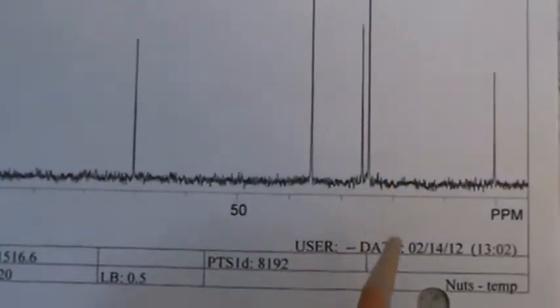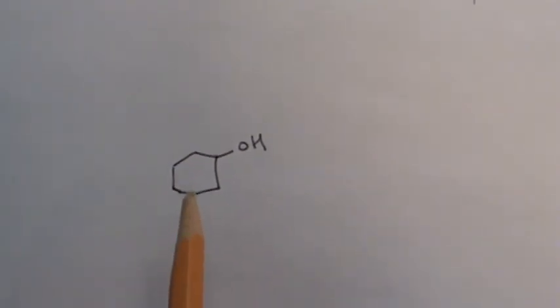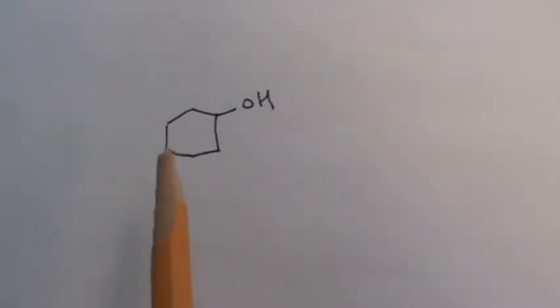The carbon spectrum, I mean, it makes pretty much sense. That's TMS at 0. The signal that's furthest down has to be the carbon that has oxygen directly on it. The next in line are these 2. Now by symmetry, these 2 carbons are the same, so you're going to get a signal for that. Then you're going to see 2 carbons that are symmetrical and 1 that's not. Now the 2 that are symmetrical, you have double as many, so arguably it should be this taller one. The shorter one logically should be this one here because there's only one of them. The heights of the carbon peaks kind of show that one. SDBS website will probably have that for you.